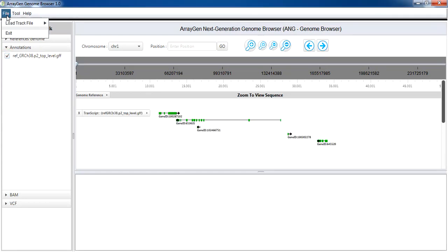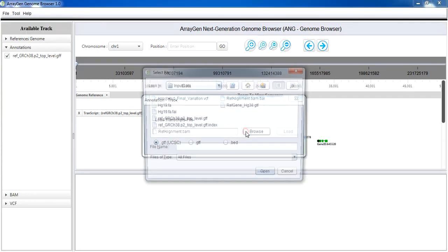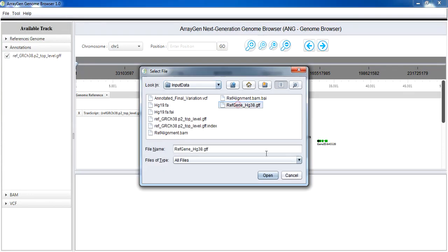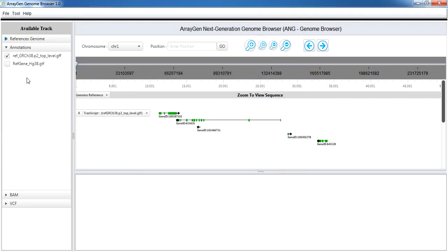Similarly, load the .gtf annotation file downloaded from UCSC. This is to observe the additional features offered for .gtf file. Load .gtf file from available track list by selecting it.